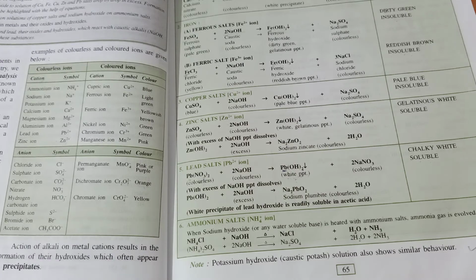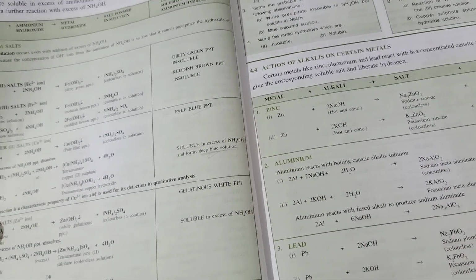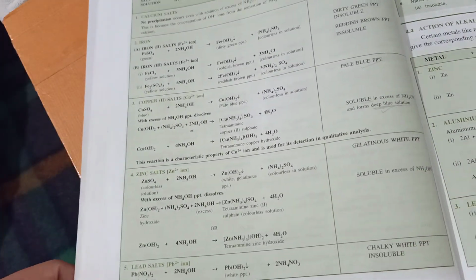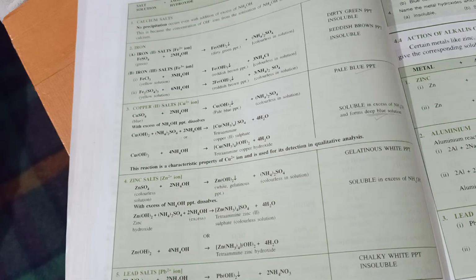Am I clear, boys? So these are some of the qualitative analyses that we can do to find out the cations present in any given salt with the help of alkalis. And we have learned the use of two alkalis: strong alkali sodium hydroxide and weak alkali ammonium hydroxide.